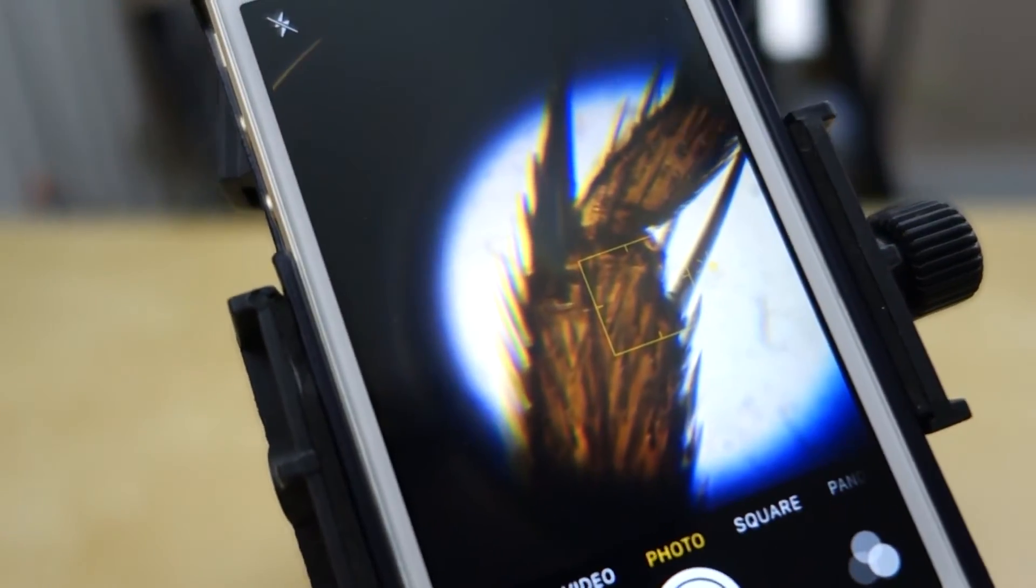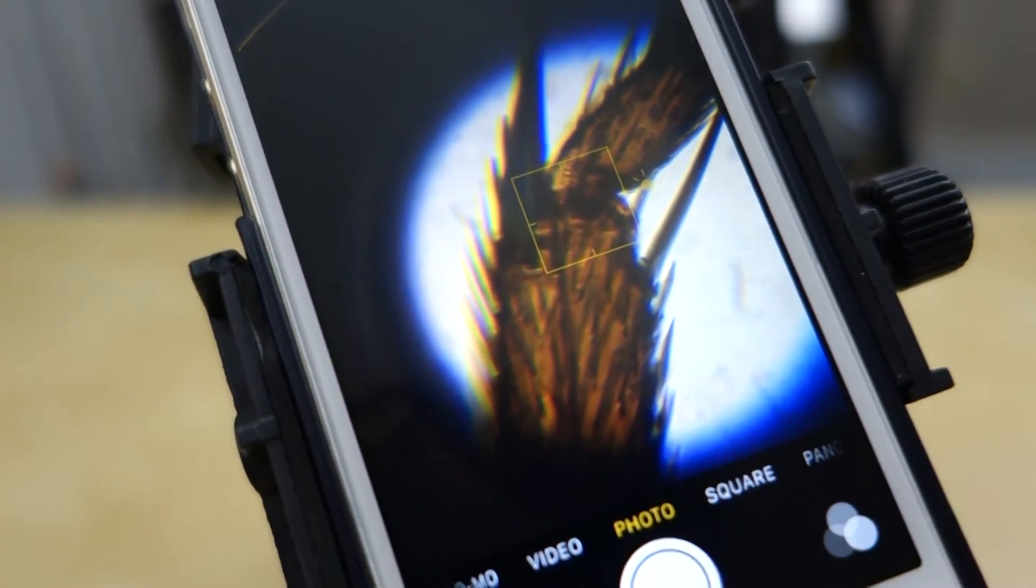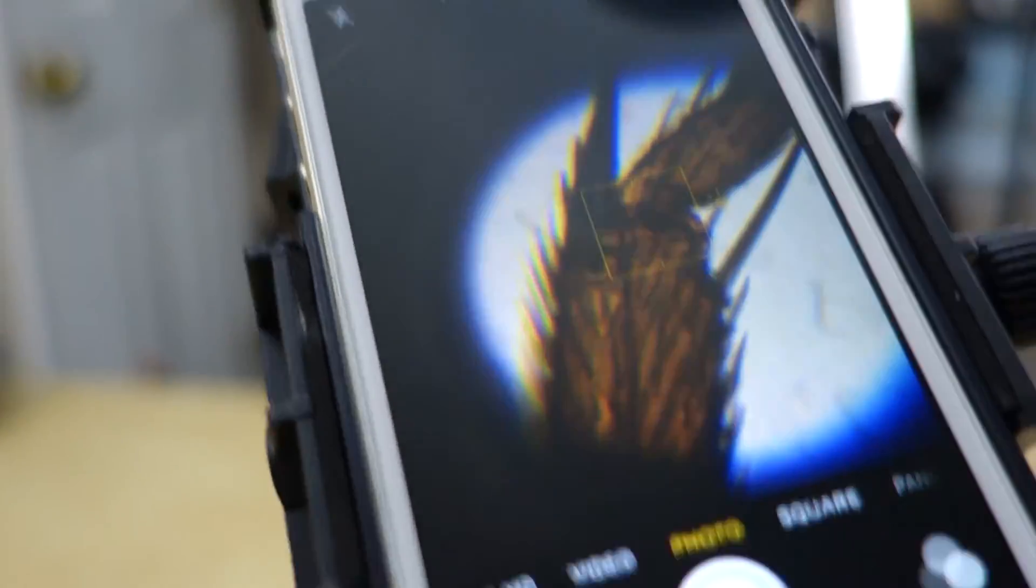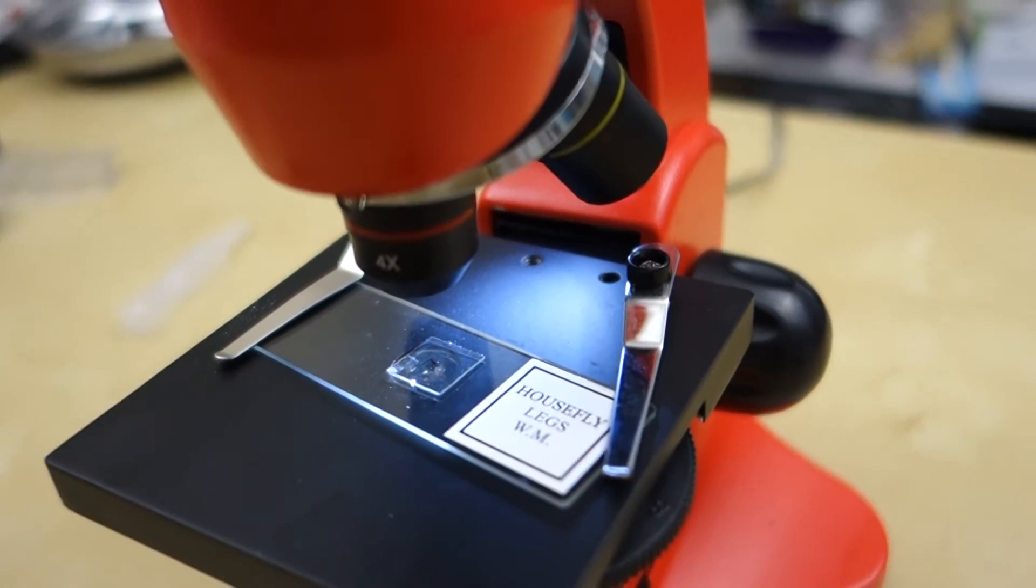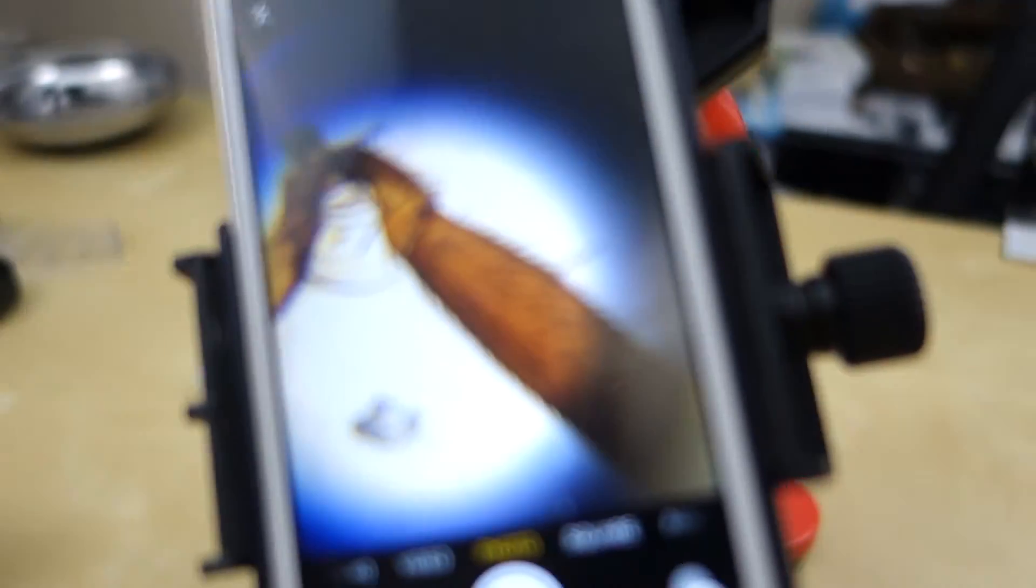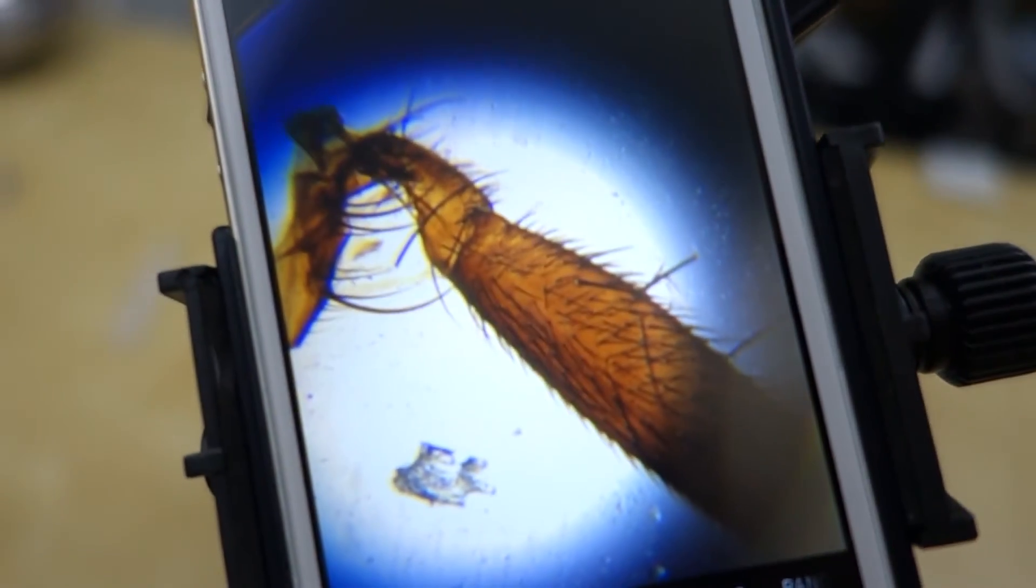And here we have that little housefly leg, as you can see. Pretty gross. But that's the kind of detail you can get. This I believe is on the 10X. So that little slice right now. Housefly. And here we can see it's 10X. So here we go again, the housefly. And this is a 4X. There we go. That's pretty nice looking. You can see.